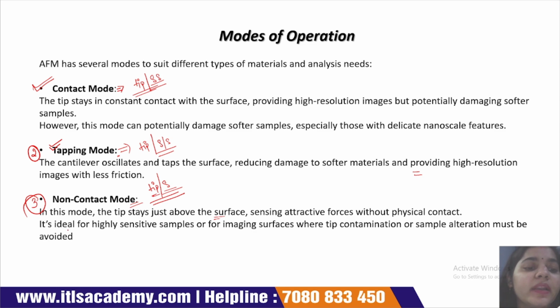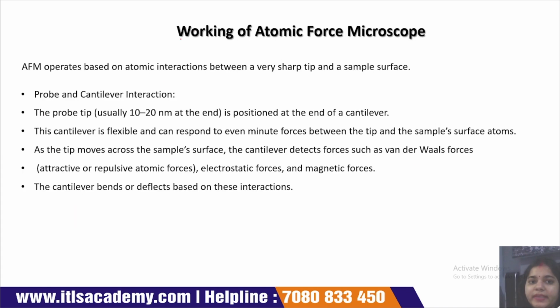And it is ideal for highly sensitive samples for imaging, where tip contamination or sample alteration must be avoided. These are the three working modes of AFM: first is the contact mode, then tapping mode, and non-contact mode. Now we understand the working modes of atomic force microscopy.